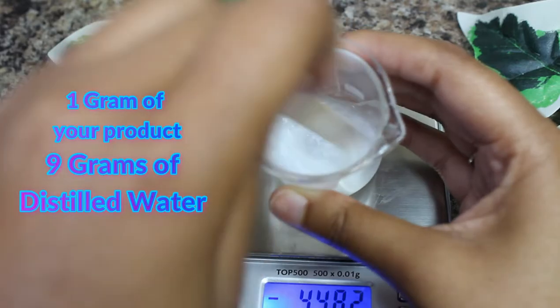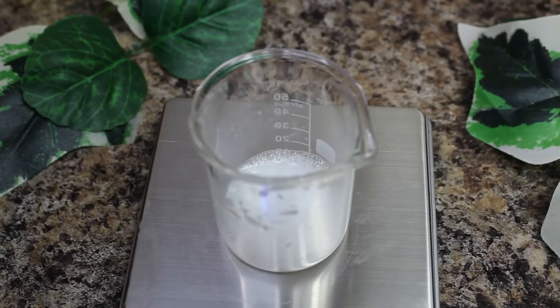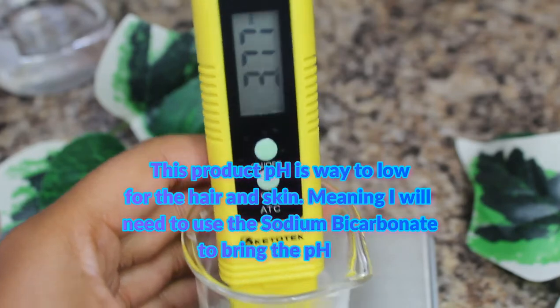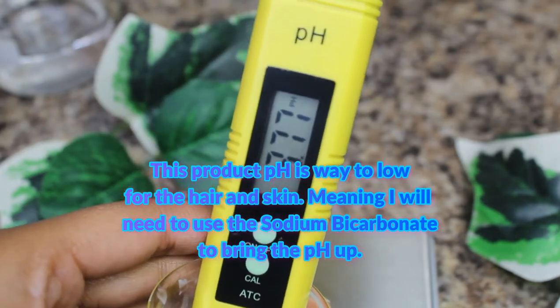Step two: make a dilution of your sample in distilled water. The product-to-water ratio is 10% sample and 90% distilled water. Stir the dilution well before checking your product's pH.